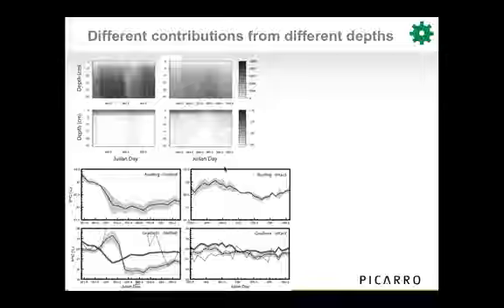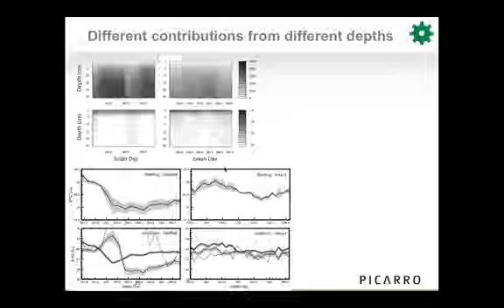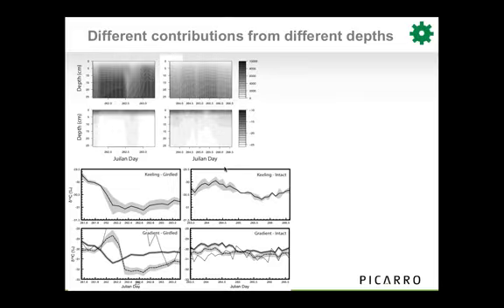was happening with depth. Whereas if we use the gradient approach, which is based on Fick's law, shown in the two plots on the bottom there, we were able to resolve some depth-dependent variation in the CO2 or the isotopic signature of flux. So on the left-hand side, in the girdled plot, the big spike that you see and then the decrease there was actually a physical effect caused by a rain event that happened about halfway through the study period. That caused the isotopic signature to change because the water was filling into the soil pores and pushing CO2 out, basically. On the right-hand plot, you're seeing the intact site.